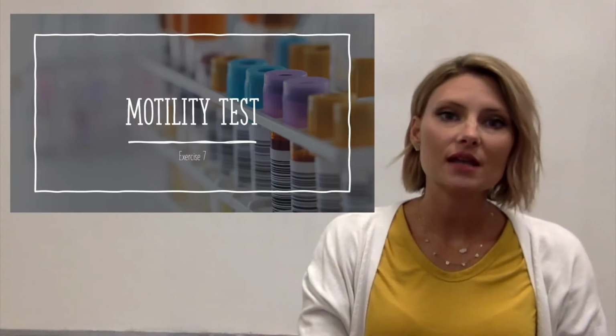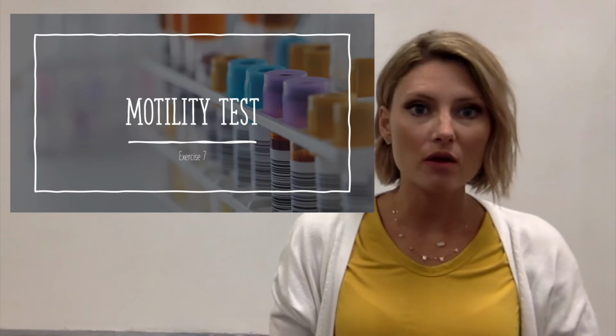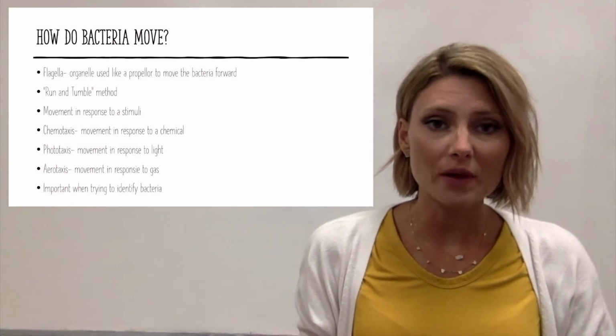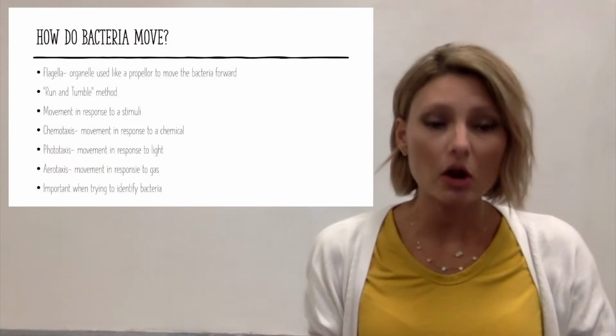Hello class, we are back in the lab today and we are going to be learning about motility of bacteria. So I'm going to go over a little bit about bacteria, how they move, what they use to move, and then we're going to go over a few different techniques, and then we are going to do what is called a motility stab.